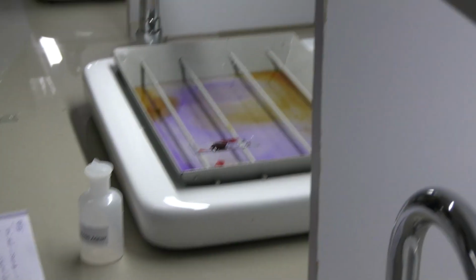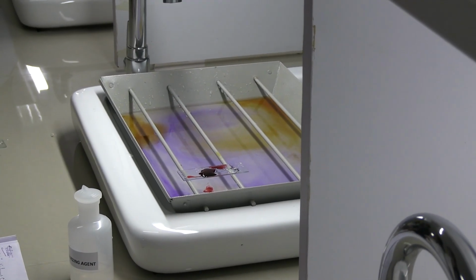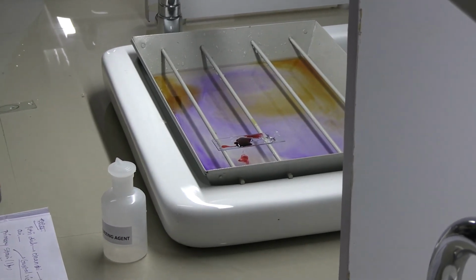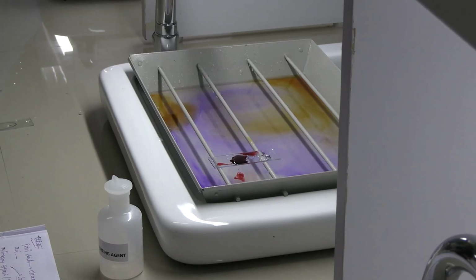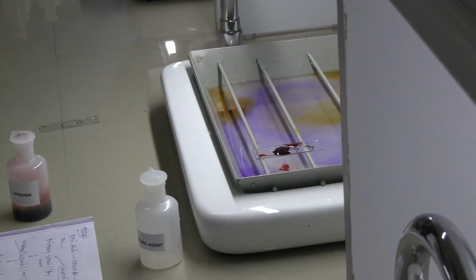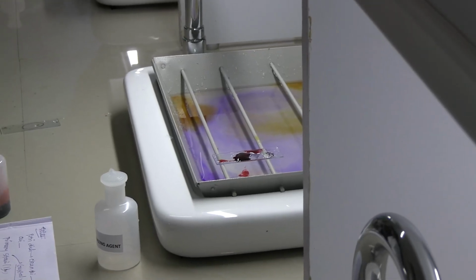What is the final thing that we need to do? We need to air dry it. Air dried and oil immersion. Okay? Can tell me. Tell me in English or Hindi so that the others can also understand.